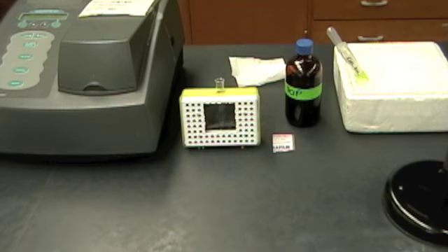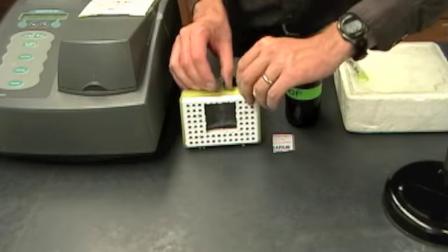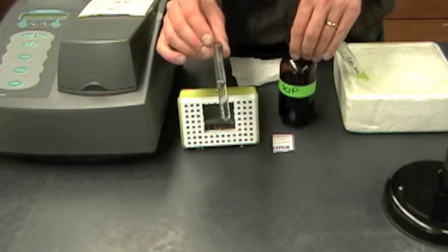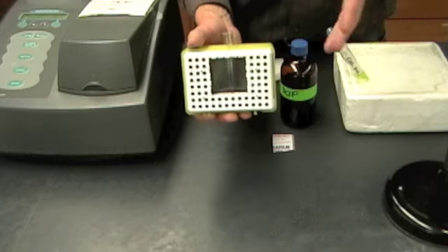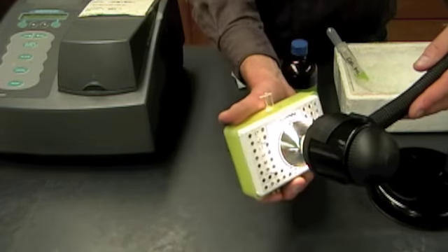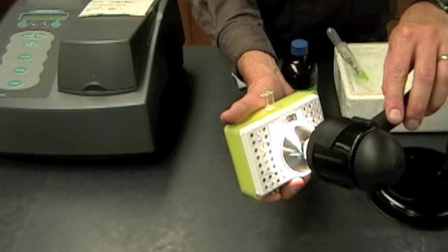Now we're ready to do the first activity, and this is one you have to think through very carefully before you begin. So I've already got the spectrophotometer set, and I have blanked it. The other thing I have set is a tube that has some of the DCIP solution in it that we're going to use to detect the presence of electrons. Now, you can see this tube fits inside this little cassette here. This is going to be important because when we're ready to go, I have my light bulb here, and I'm going to hold this right up against the light bulb, and this is going to establish the right distance between the tube and the light to give me the reaction that I need.